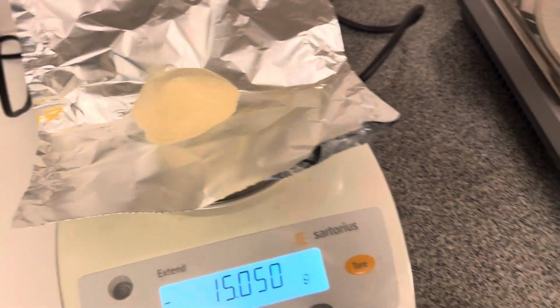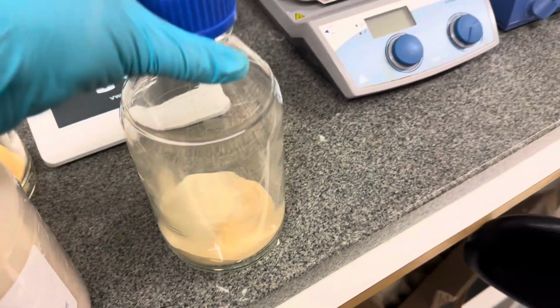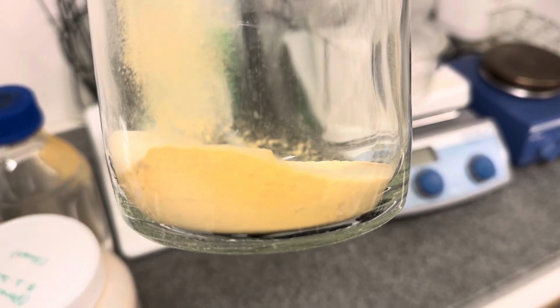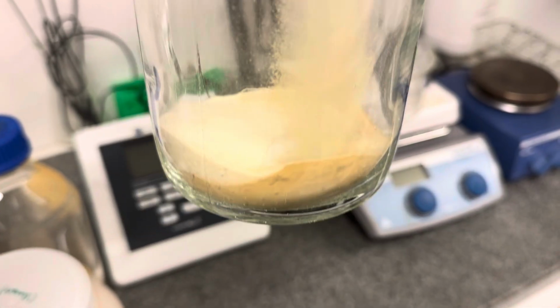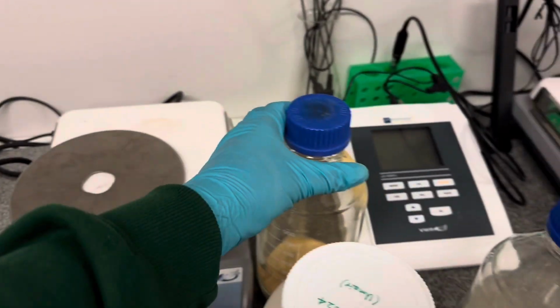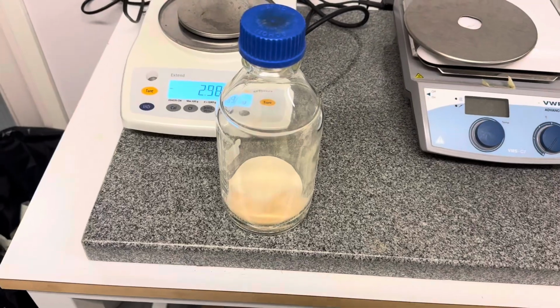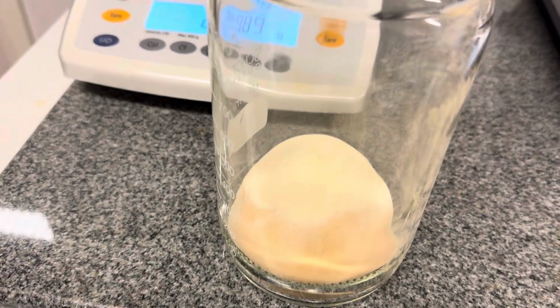And I will be taking this and pouring into these bottles. As you can see here, this yellow part, this one is actually malt extract, and this whitish part is agar that I already poured into one of the bottles. Now I will be pouring that portion into this bottle. Okay, you know what, now it is already there, my malt extract along with agar.